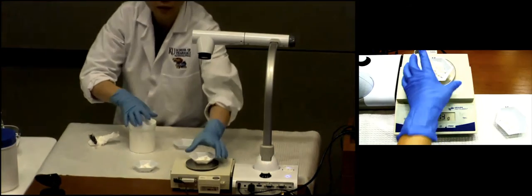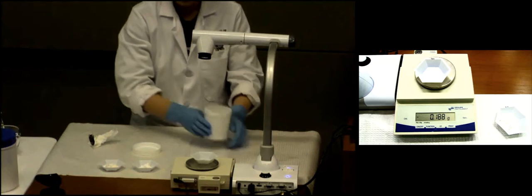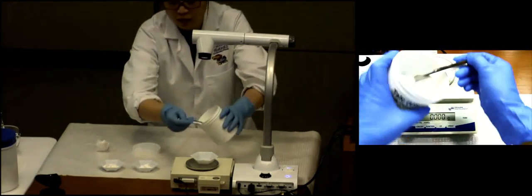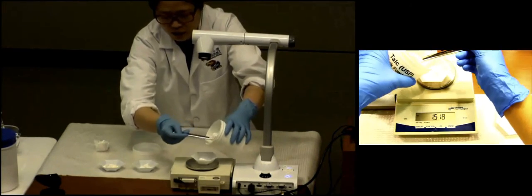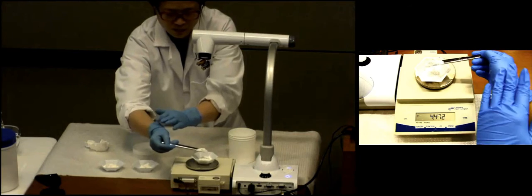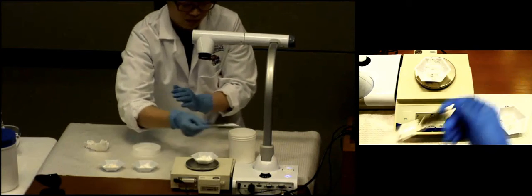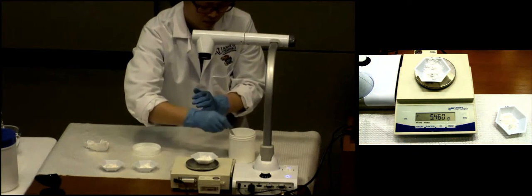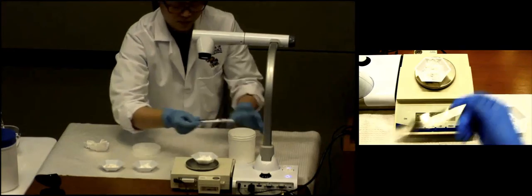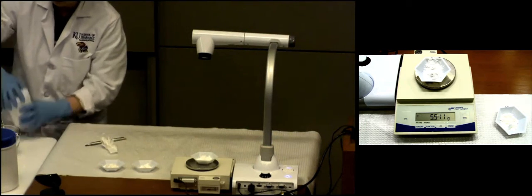Okay, next one is talc. Again, make sure you tare between weigh boats and clean your scooper. Okay. So talc is 5.511. Talc is 5.511.